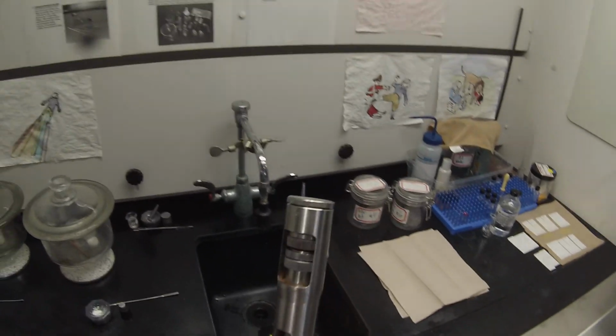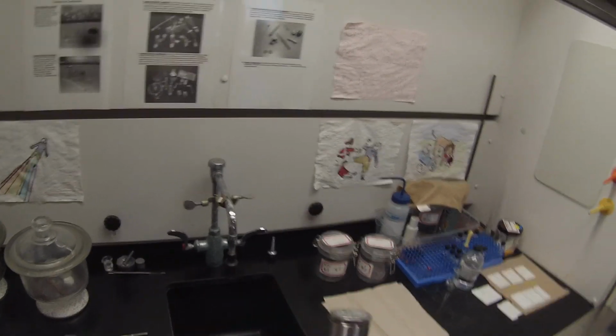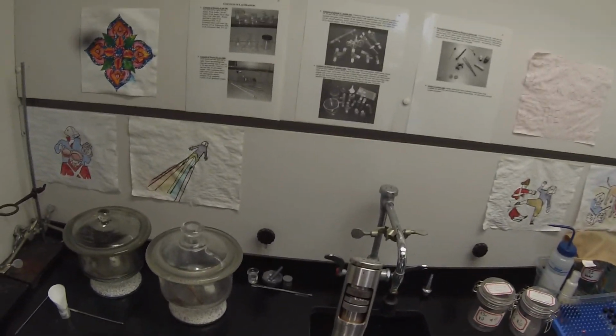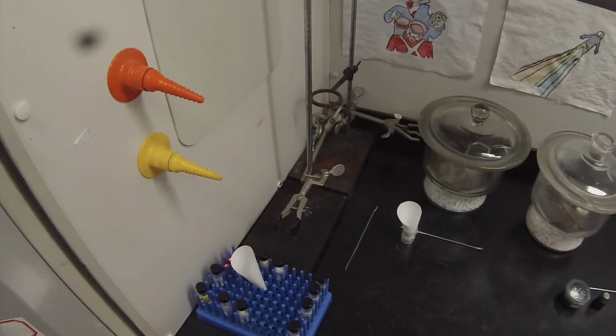I may need to loosen it a little bit. May have loosened it too much. That was a little less resistance than I usually like to feel. But we'll see. Maybe we'll get a decent pellet.